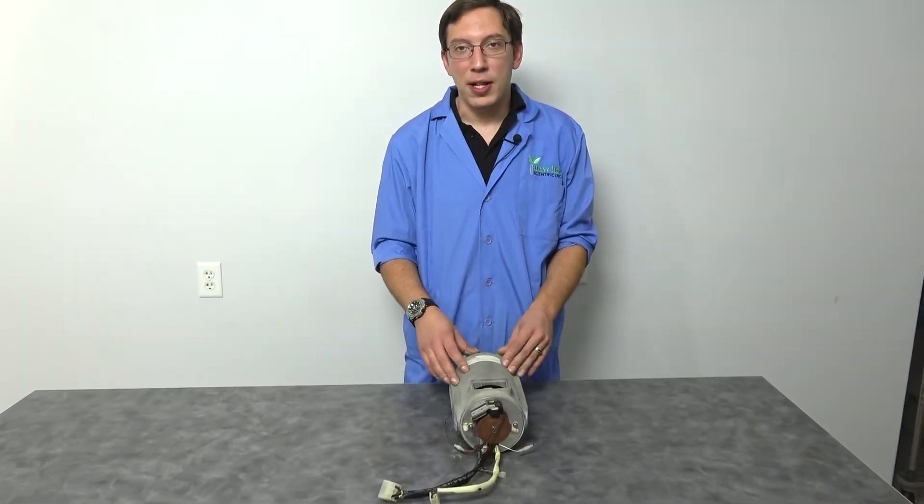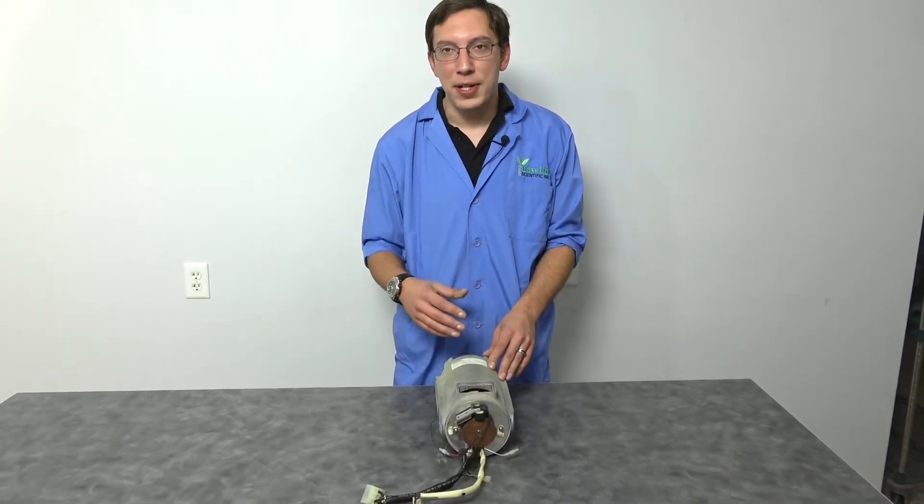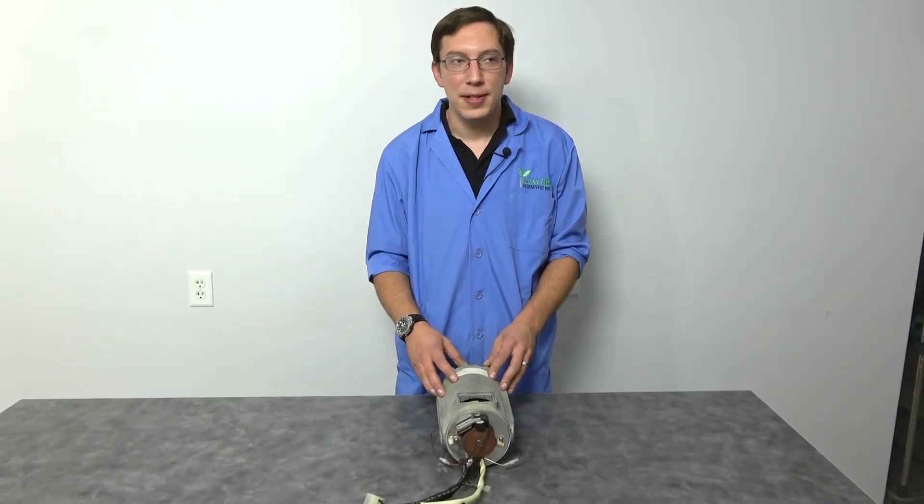This motor is specifically out of an RC3 series. However, it's going to be the same kind of procedure as long as your motor has brushes. It could be your J series, your Allegra 6 series.